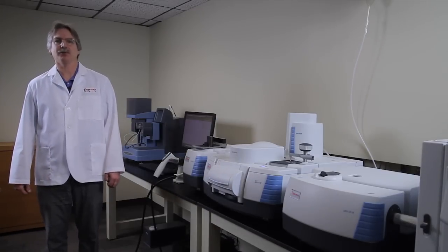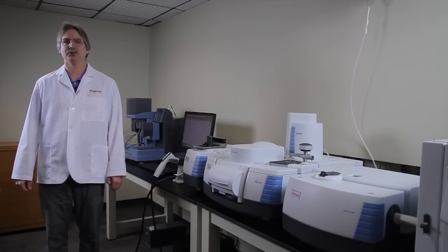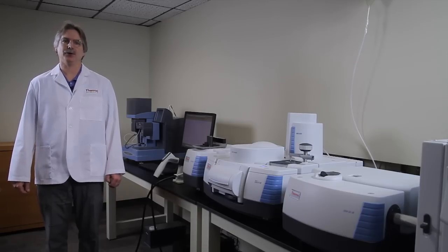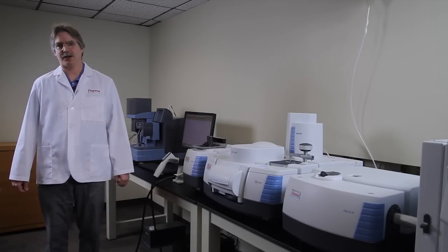Hello, I'm Todd Strother, and I work for Thermo Fisher Scientific in Madison, Wisconsin, and I'd like to talk to you today about polymer analysis we do with our Nicolay IS50 FTIR spectrometer.